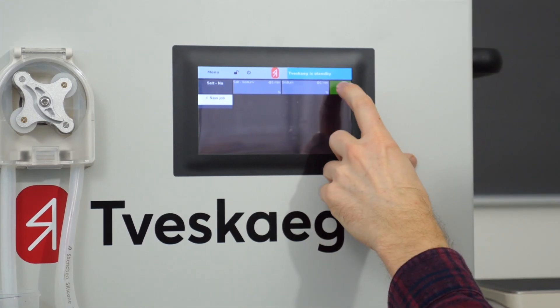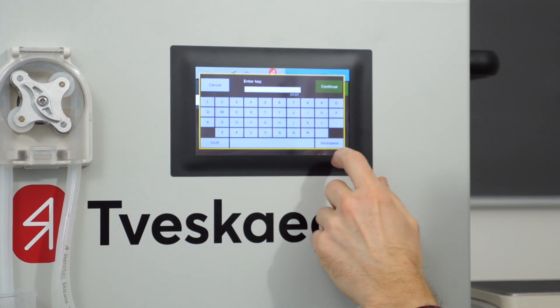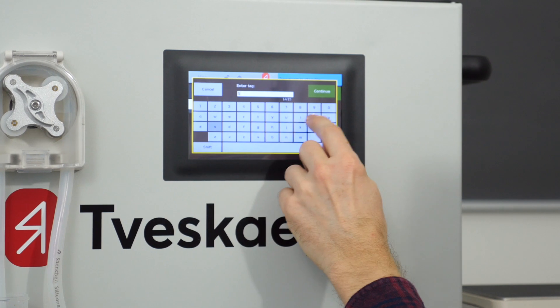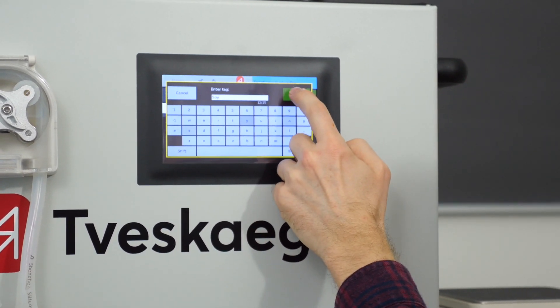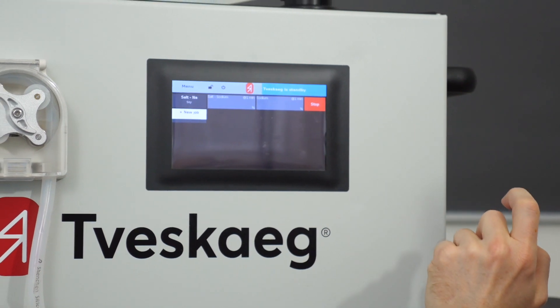The only thing I need to do now is press Run. Just press a tag in here — soy — and press Continue, and the system starts.